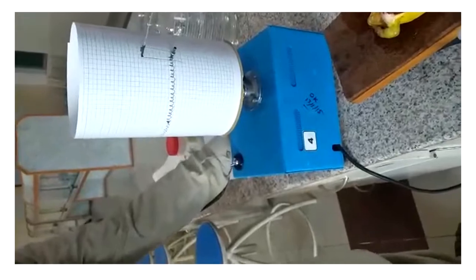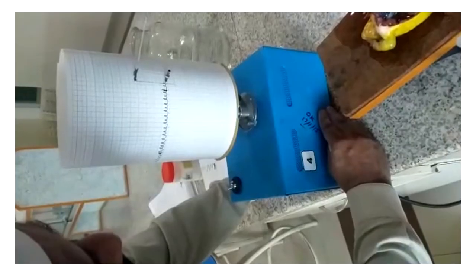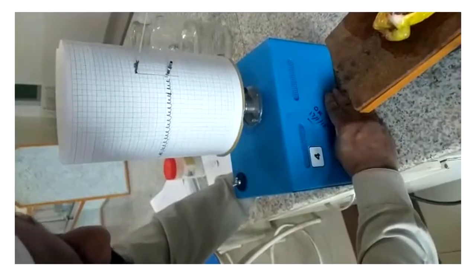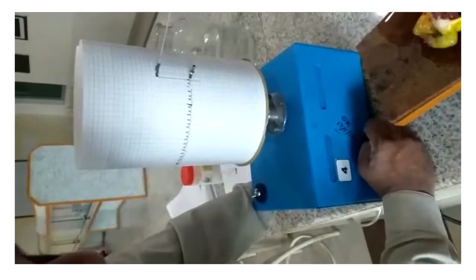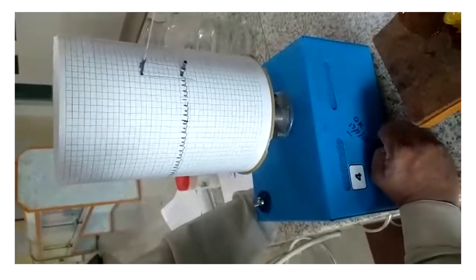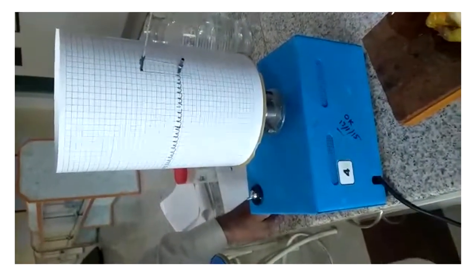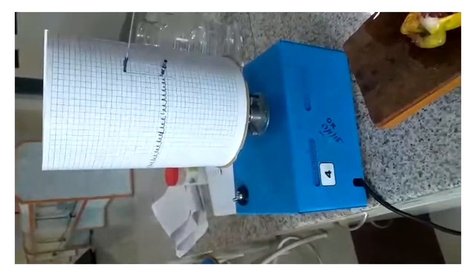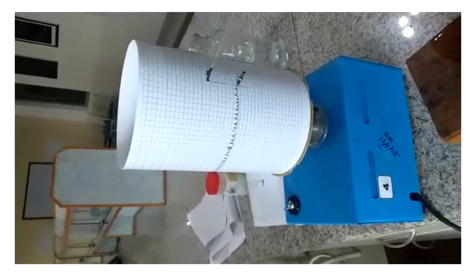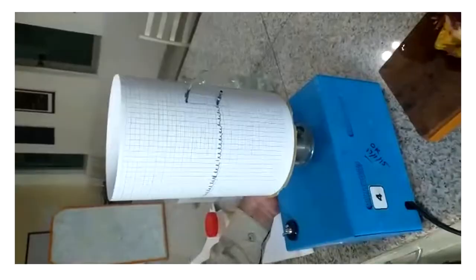Now we will take the reading. So you can see that it is similar to the normal reading we took before. That means that acetylcholine is not working because atropine has blocked the receptors. Stop.